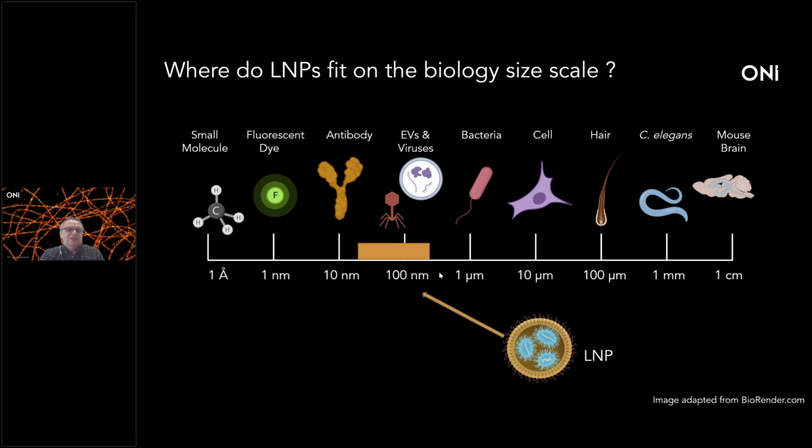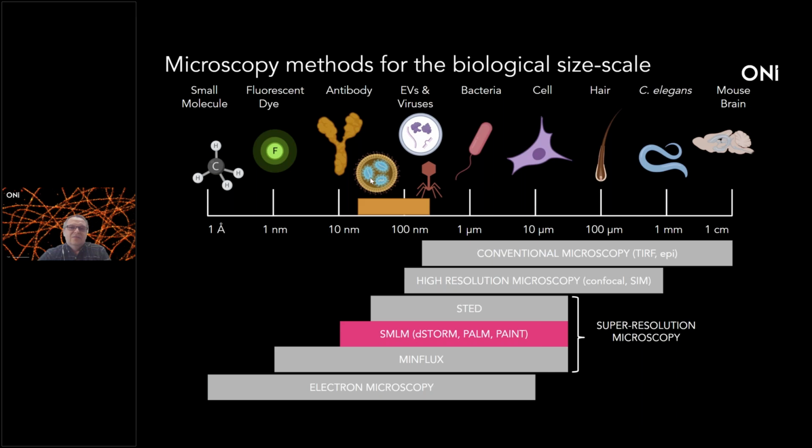And then we need to understand that if the lipid particles belong here, what type of microscopy techniques we can use to see them. Because seeing is believing. So basically, we would like to see what individual lipid nanoparticles look like on a microscopic scale. So to study these lipid nanoparticles, we need to understand which microscopy techniques can be used for it.